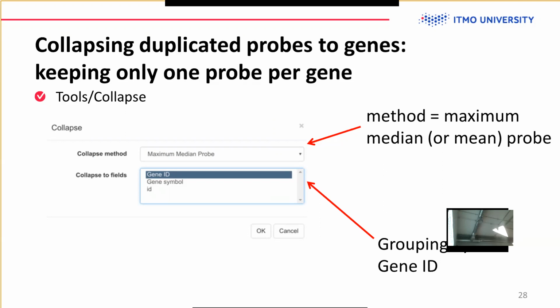The data should be fine-grained enough to discern different isoforms, and the analysis and interpretation are far from easy. I believe there will be a part about how to use isoforms in the module next week. But it's not that easy to work with isoforms on microarrays, in particular from this one.